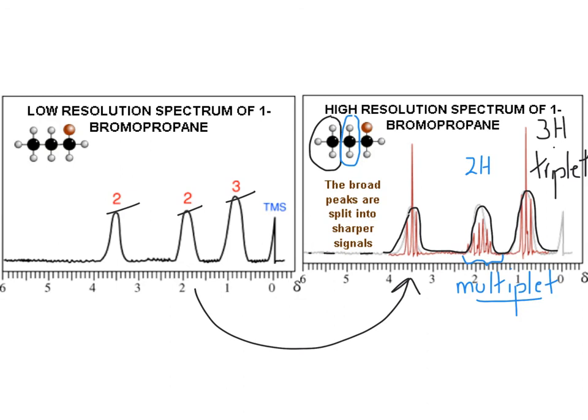Now if we look at the last 2 hydrogens, they are causing this peak with the greatest chemical shift, because remember they're attached to the carbon that's directly attached to the bromine. If we look at the adjacent carbon, there are 2 protons on that adjacent carbon. Remember it splits up into 1 more than that, so again this has split up into a triplet. Now we will come back to this next lesson, but there's just a wee bit of a preview of our next.